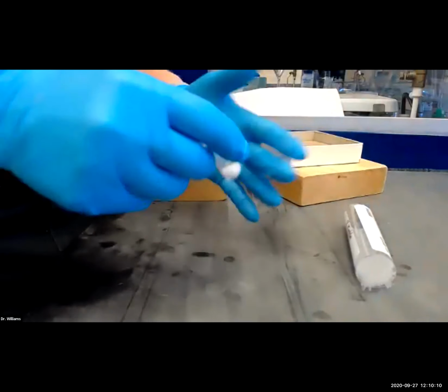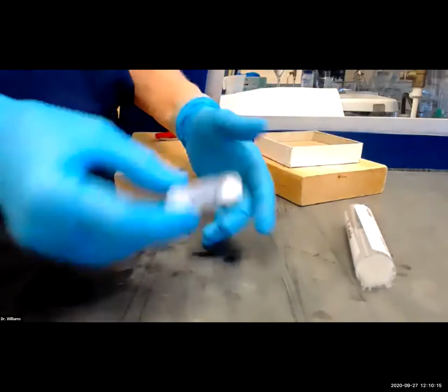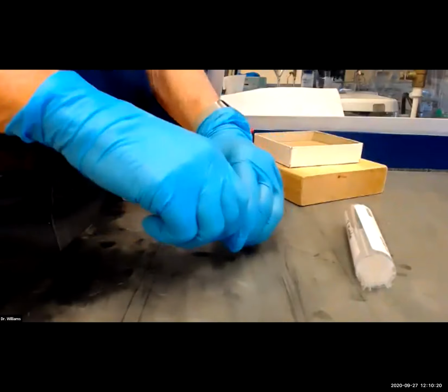I wear gloves. You may be allergic. Some students are allergic to caffeine and other chemicals. So wear gloves, take your sample. You've already prepared this for your caffeine.